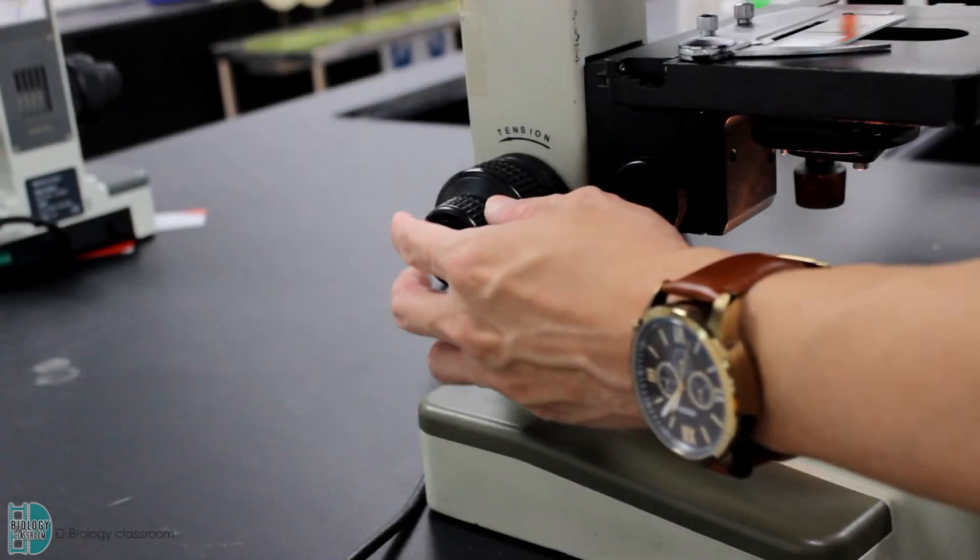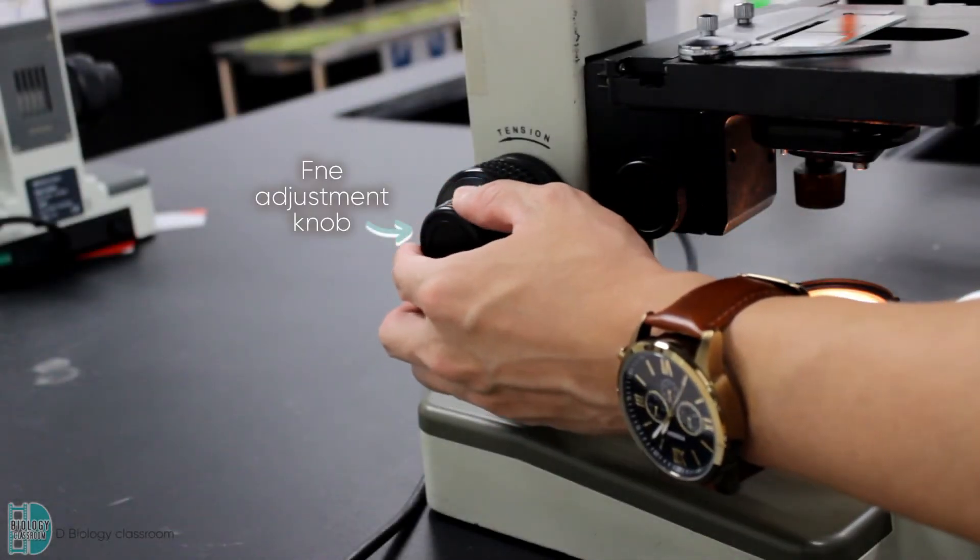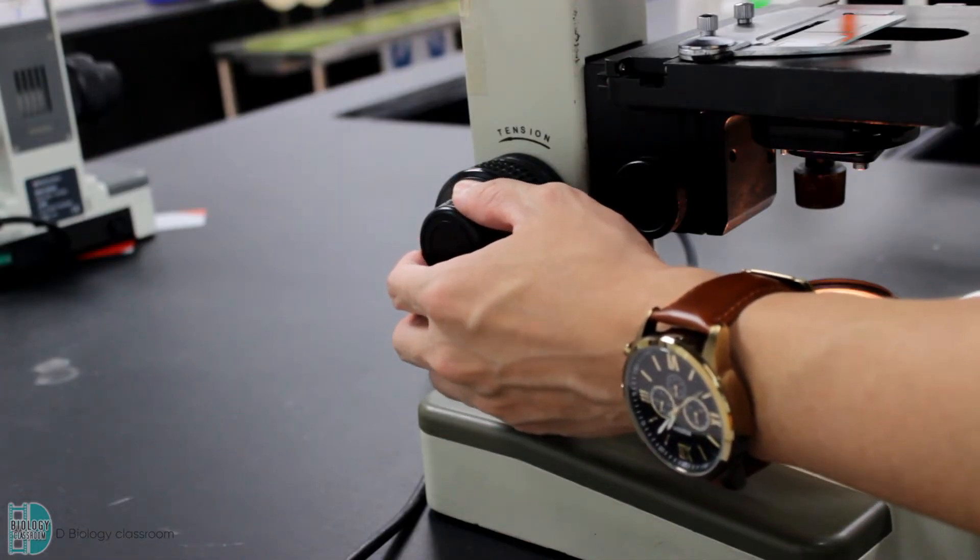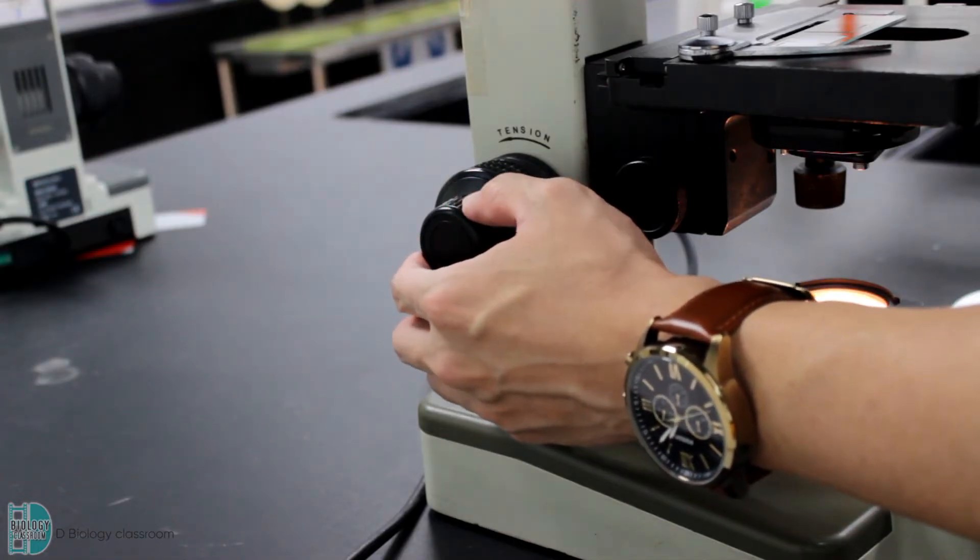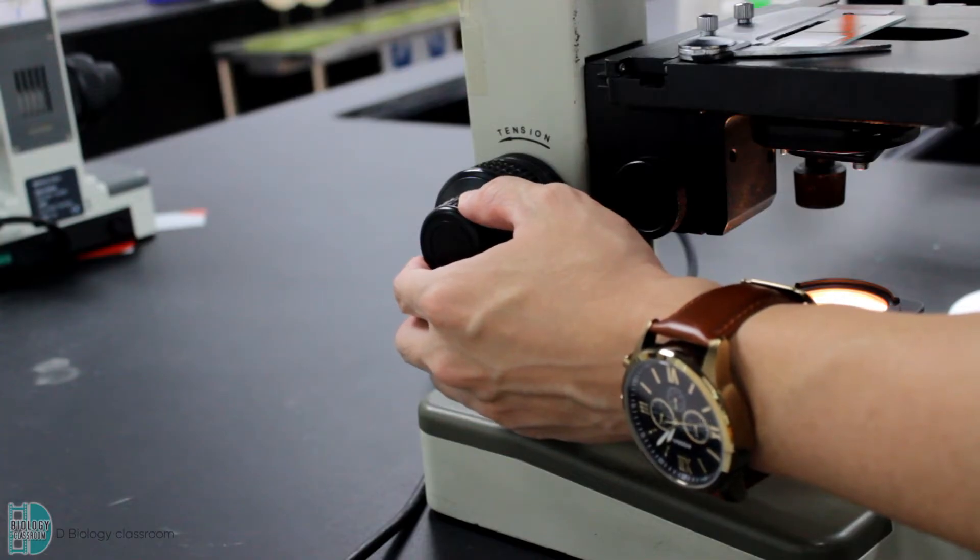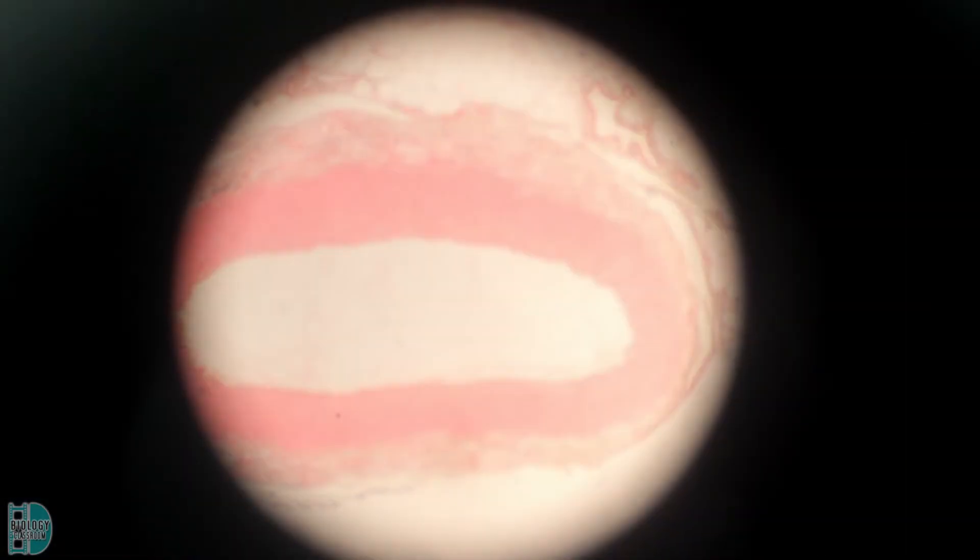It is usual that the image is not very clear at this point. Now, use the fine adjustment knob to fine-tune the stage. The movement is very small and you won't be seeing the stage moving, so don't worry about this. Adjust the knob until the image is sharp and clear.